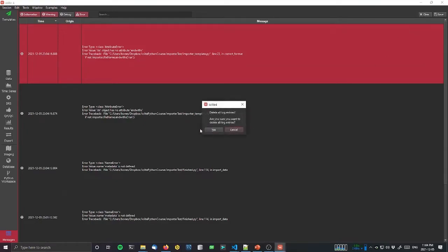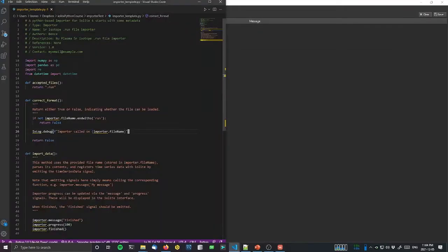I'm going to clear all these messages. So this means this should actually be endswith, not ends with.